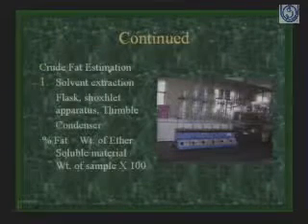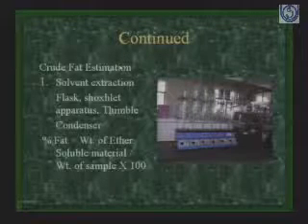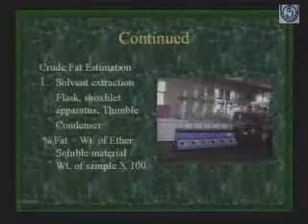Another major constituent of a food is the fat. Fat you can feel, but you cannot quantify it unless you take it out from the food. And how can it be taken out from the food? Because fat is soluble in petroleum ether or diethyl ether. So you have to mix the food with the diethyl ether or petroleum ether, and then you take it out.